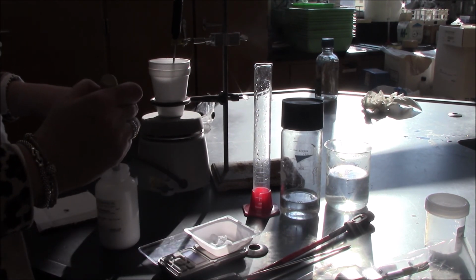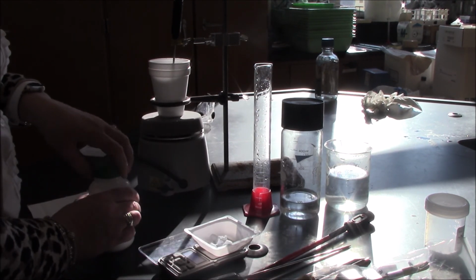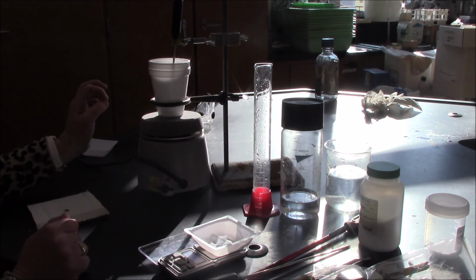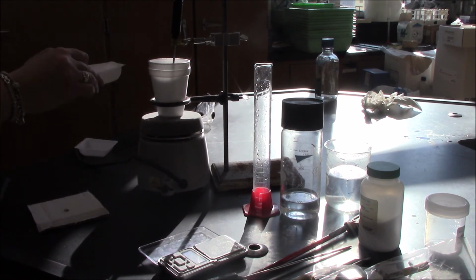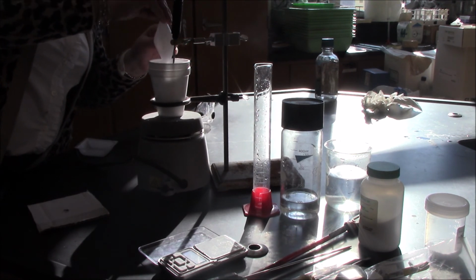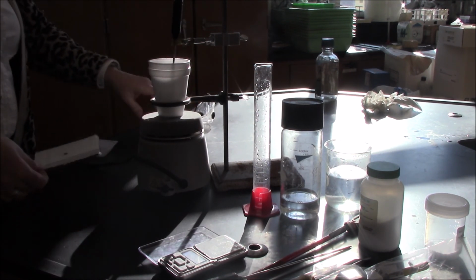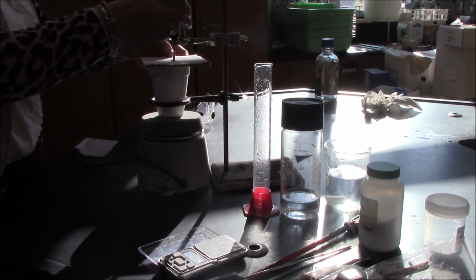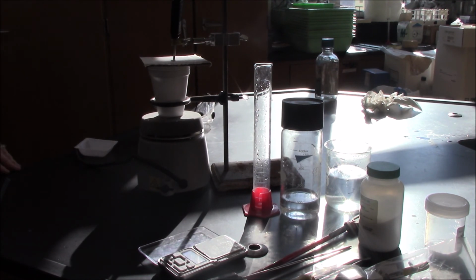Oh, look at that. 5.00 grams. My initial temperature here is 23.2 degrees Celsius. I'm going to add my 5 grams. I'll add my lid. I'm watching the temperature increase already. And again, I'll monitor the temperature on the thermometer until it reaches a maximum value.